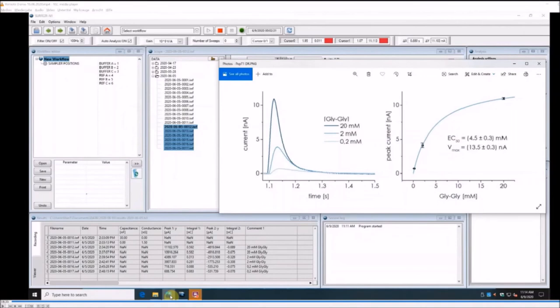Can you use intact cells and measure transport? So generally, yes, you can. So far, we have used HEK cells and CHO cells and the cardiomyocytes Maria presented, but we usually recommend to use plasma membranes since the signal to noise is better and assay development is much easier.